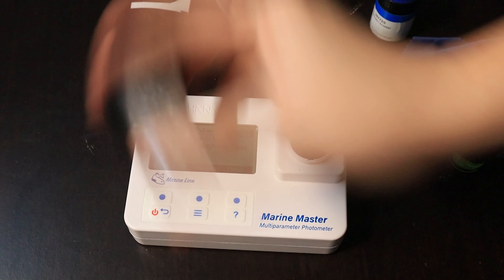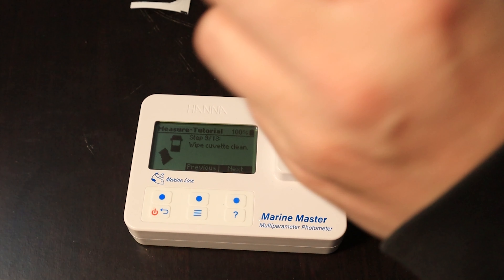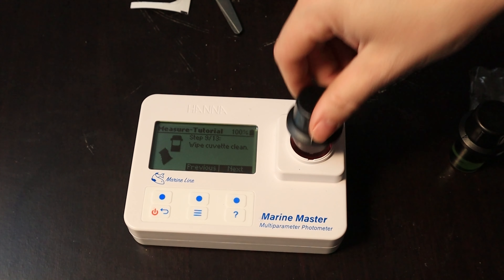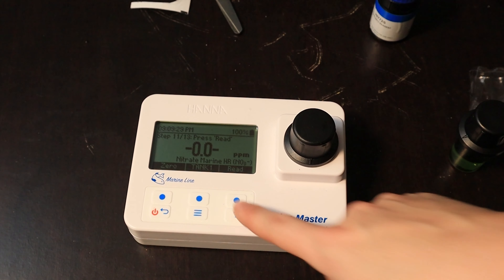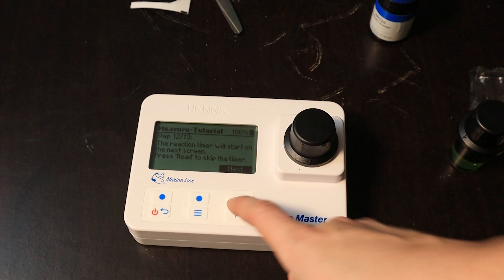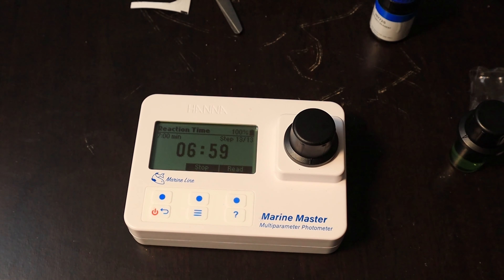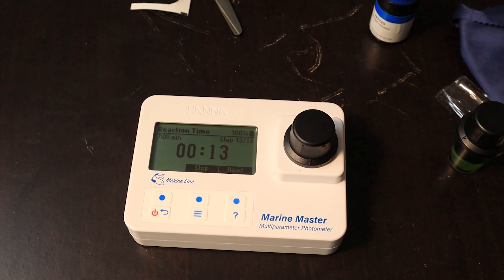It says shake vigorously for 120 seconds. Then it says to wipe it clean again — put it back in, hit next, it says insert it, did that, and hit read. Then there's the timer — you have to wait seven minutes and it will read the results. Okay, the last 15 seconds here — kind of excited about this.